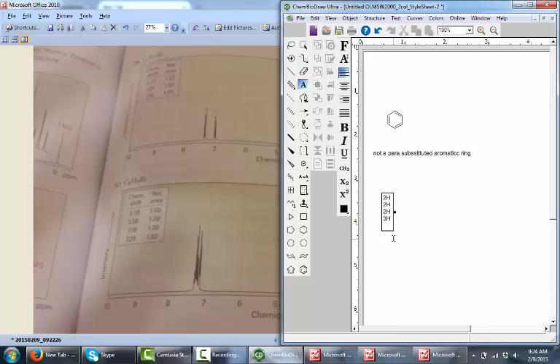And then the second thing I'm going to want to figure out here is, let's write the ppms here as well. 7.18 ppm is 2H. 7.29 ppm is 3H. 3.16 ppm is 2H, and now 3.56 ppm is also 2H.